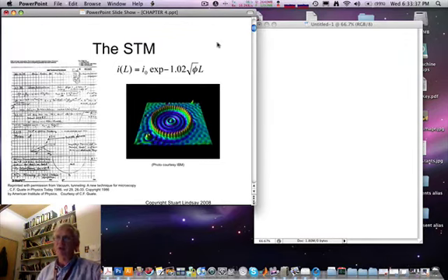This image on the left is a page from Gerd Binnig's laboratory notebook at IBM Zurich. What he does at the bottom of the page is to calculate, if one takes a probe of radius 1 micron, so a very blunt probe, where the tunnel current comes from. Most of it is localized, because of this exponential dependence, to an area that's only about 45 angstroms in extent. So Binnig realized that he could use a fairly blunt and therefore stiff probe, but still achieve high resolution.